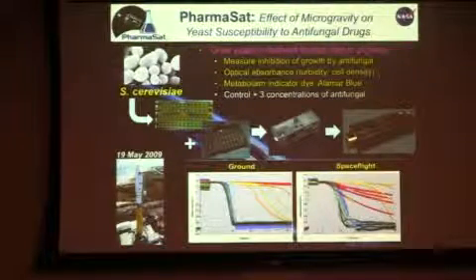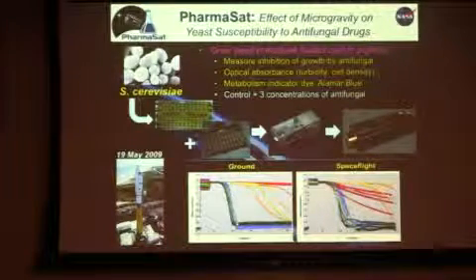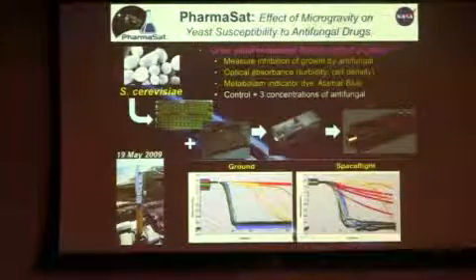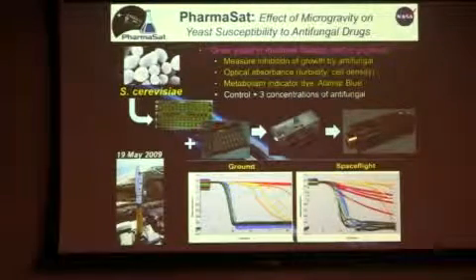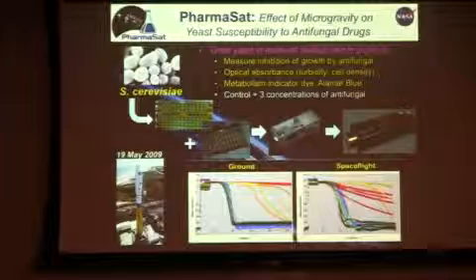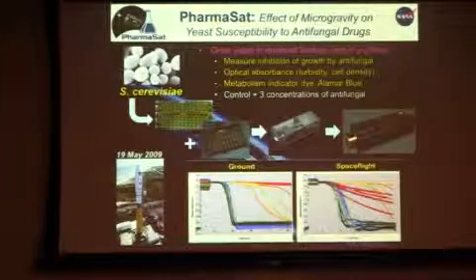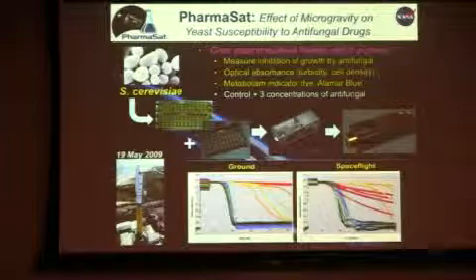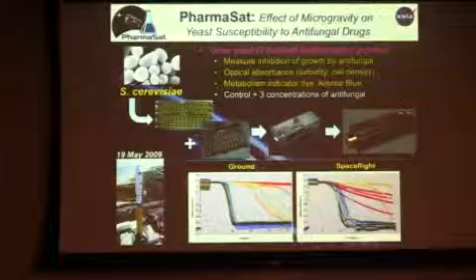So what's the y-axis? So the y-axis is an optical signal, and it's the optical signal of a dye called Alamar blue, which changes from blue to colorless. So this absorbance up here, which starts somewhere around, I think, 1.5, is when there's a strong blue color, and then the blue goes away, and this is colorless down here. So we're just looking at the disappearance of blue color.